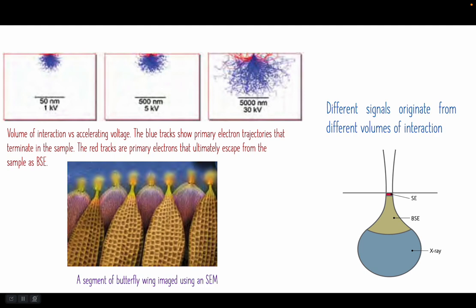We also have characteristic X-rays. When an electron from a higher energy level drops to fill the electron hole in a lower level, the difference in energy might be emitted as high energetic electromagnetic radiation in the form of an X-ray quantum with a characteristic energy. X-ray microanalysis uses an energy dispersive X-ray spectrometer to count and sort characteristic X-rays according to their energy. The resulting energy spectrum exhibits distinctive peaks for the elements present, with the peak heights indicating the element's concentration.